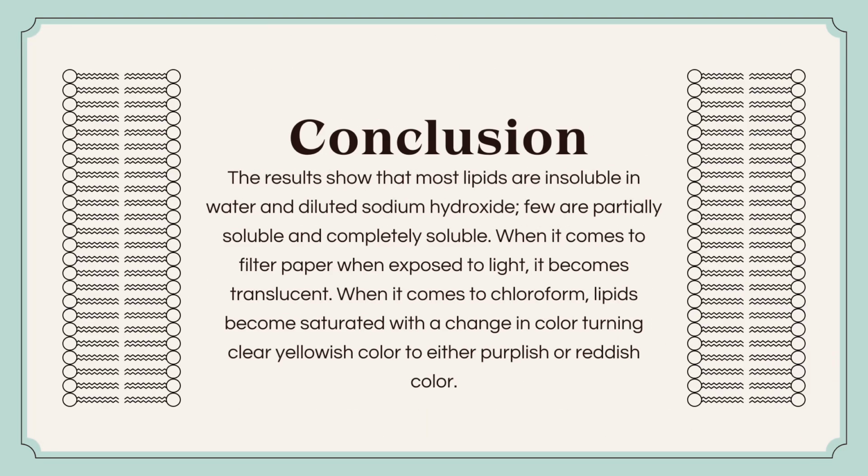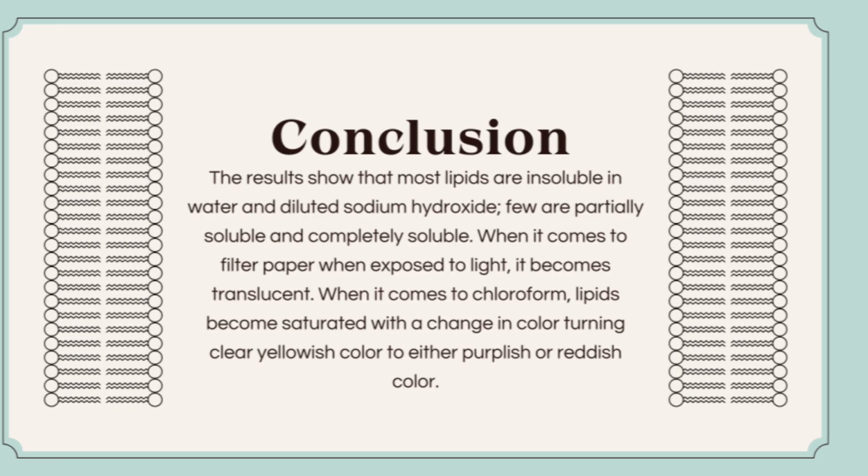In conclusion, most lipids appear to be insoluble in water and dilute sodium hydroxide, but some are partially soluble and completely soluble. When put on filter paper, it becomes translucent, another unique characteristic of lipids. And when it comes to chloroform, the lipids become saturated with a change in color from yellowish to either purplish or reddish.